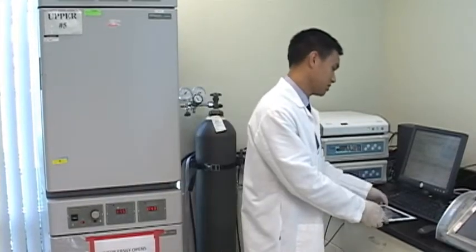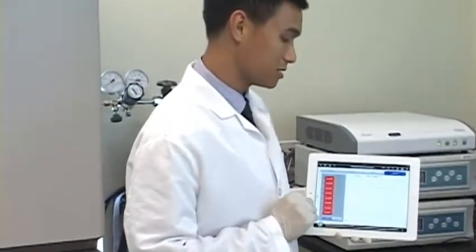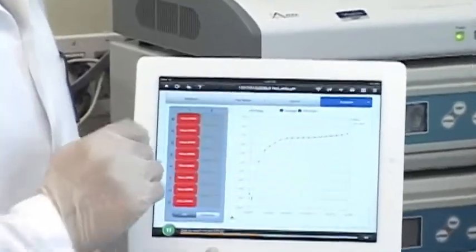Welcome back to the receptor signaling assay. Last night we plated our cells and monitored the cell index overnight. And so as you can see in the software, we actually established quite a nice baseline from which we can normalize the cell index once you add your compounds. And so from this point on, we have our cells growing nicely. We have a nice growth curve. We're actually ready to add the compounds.